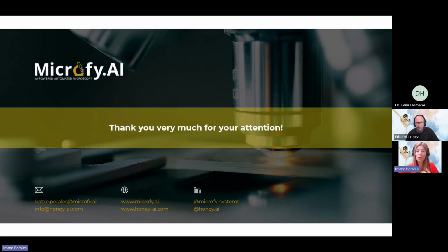We cannot do organoleptic analysis. This is a microscope. Organoleptic is on your side, the user side, or you send it to the lab. But we can provide you with the pollen spectra. So even if you decided on Helianthus, at the end, if you check the pollen spectra, you will see the composition, the concentration of all the species above 9%.